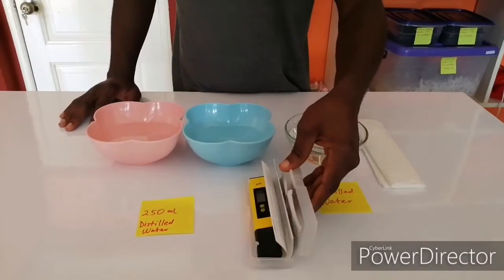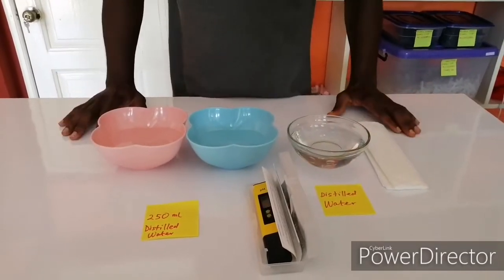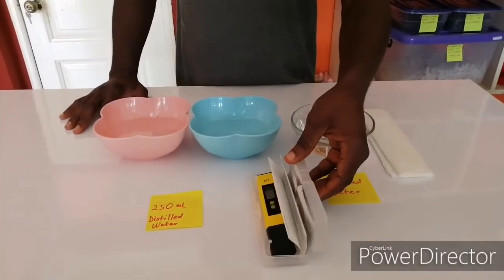There are a lot of mistakes people do when buying the pH meter or when using the pH meter. So throughout this video, I'm going to be showing you what to do, what not to do, so that your pH meter will be working for you for a long time.